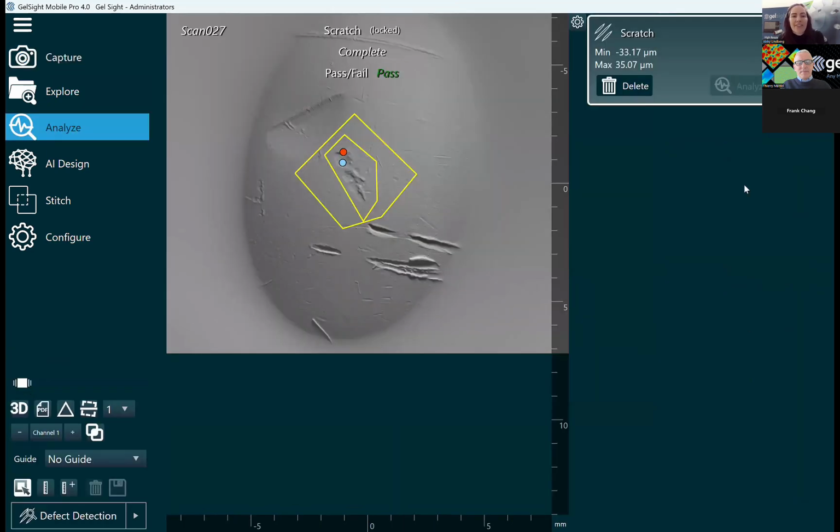So the way that this function defines the reference surface is it takes what's outside of the first shape, but inside of the second one to define that reference surface. So we actually do want it to be larger than the first shape. I think Frank answered with a ratio for that, maybe like 3 or 4 times larger than the first shape, to give us enough data to build the reference surface. So I think we're doing a 4th order form fit to that data to really define what we're going to be measuring against. So the accuracy for this system specifically is going to be 1 micron plus 4% of the nominal in the Z direction.